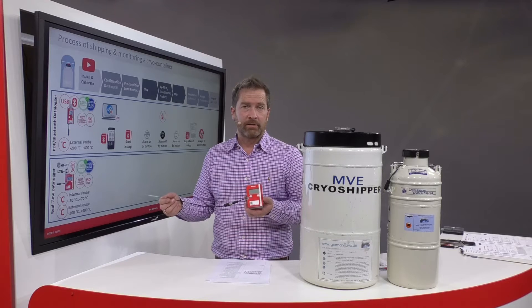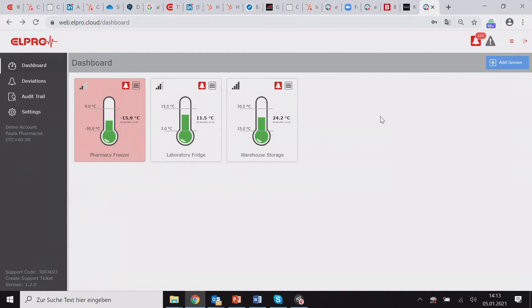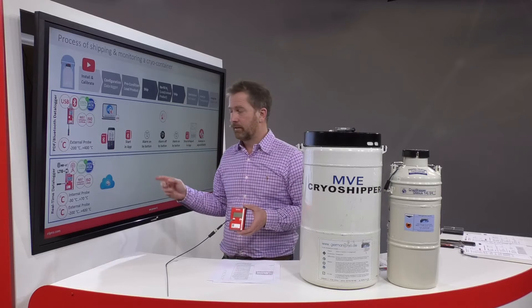Let's now look at the second option: the real-time device. The configuration of the real-time device takes place via web browser in the Elpro Cloud software by running through a wizard to add a sensor. The main difference is not only that we monitor and transmit data in real-time, but we also monitor different parameters.